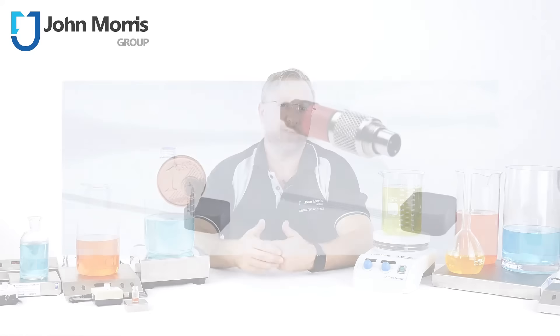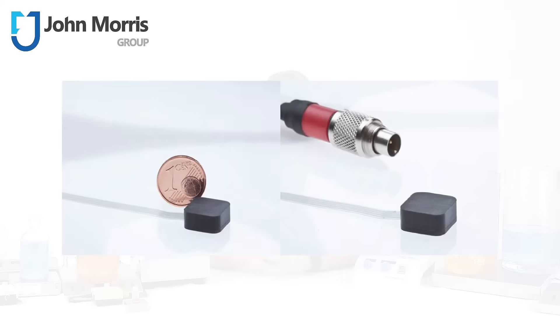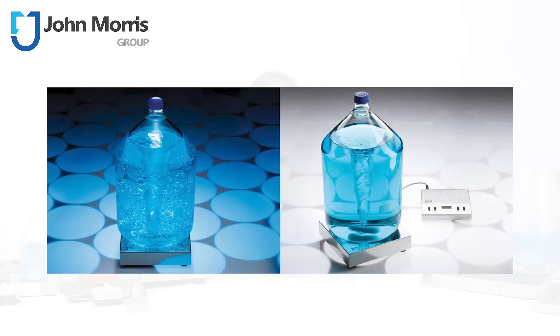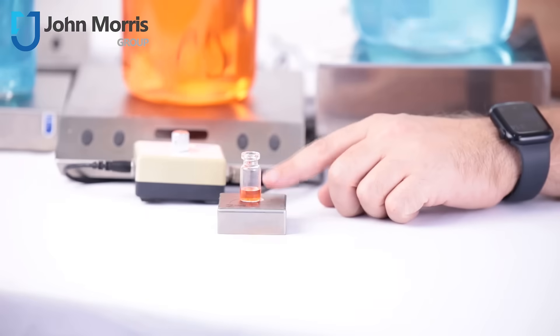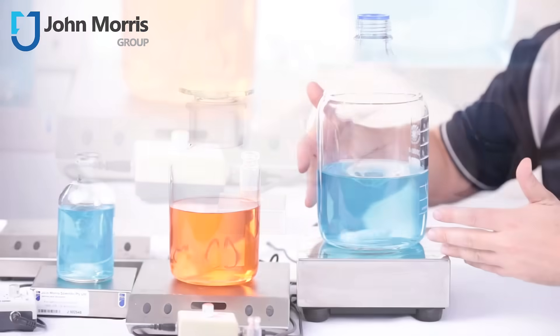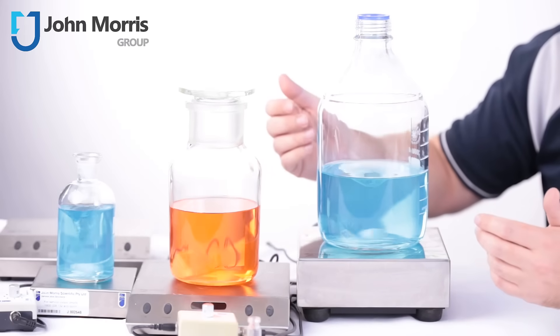Or you can have stirrers which are very small for OEM applications and super strong for industrial applications. For instance, this little beast over here is perfect for keeping fluids in a cuvette moving, whilst this big boy can stir up to one tonne of water.